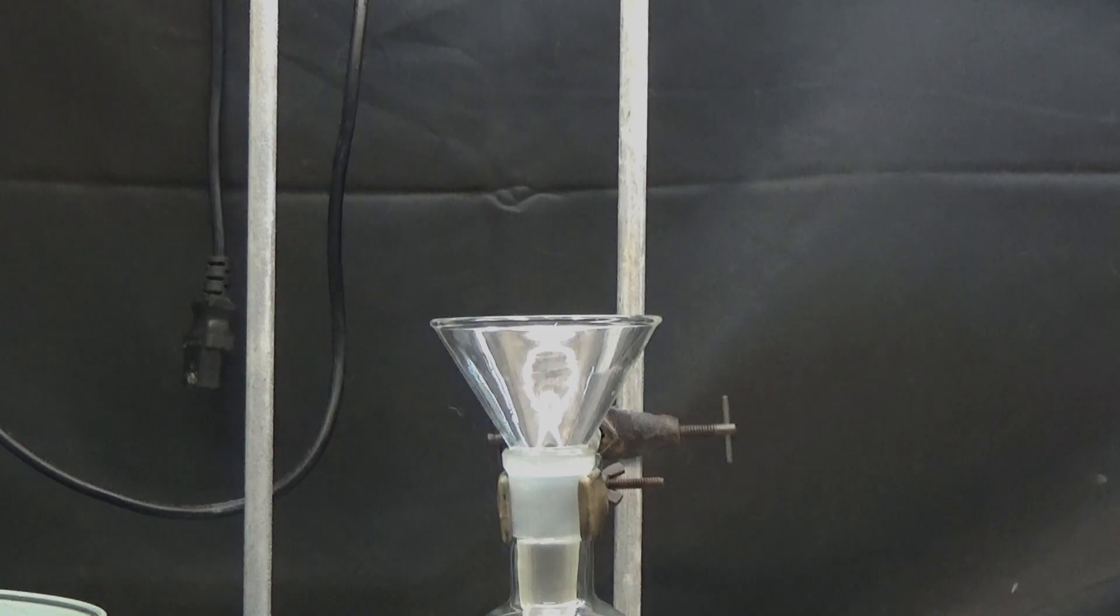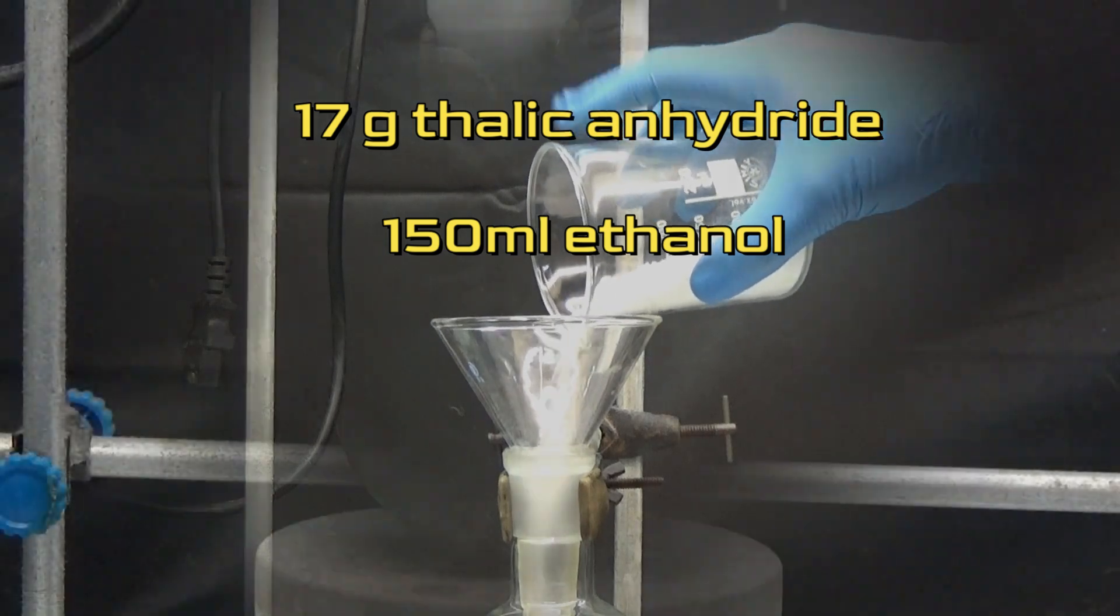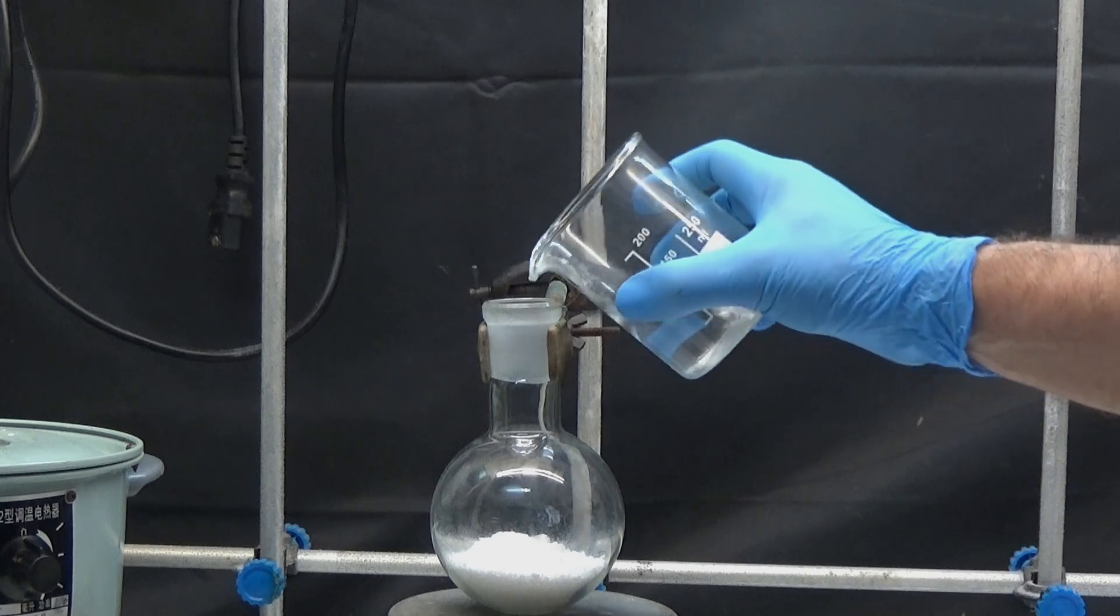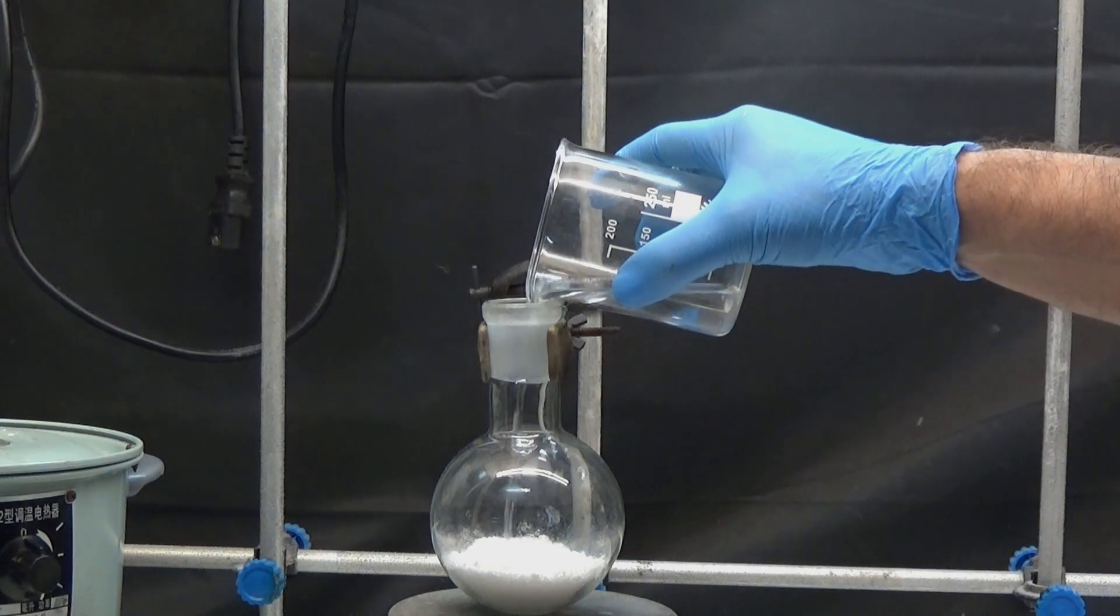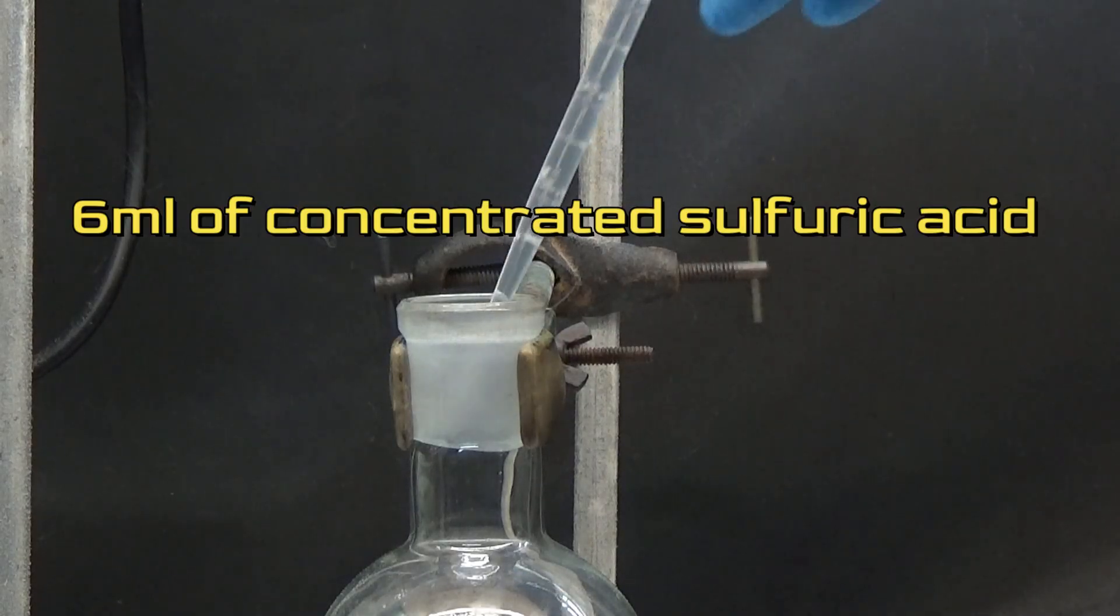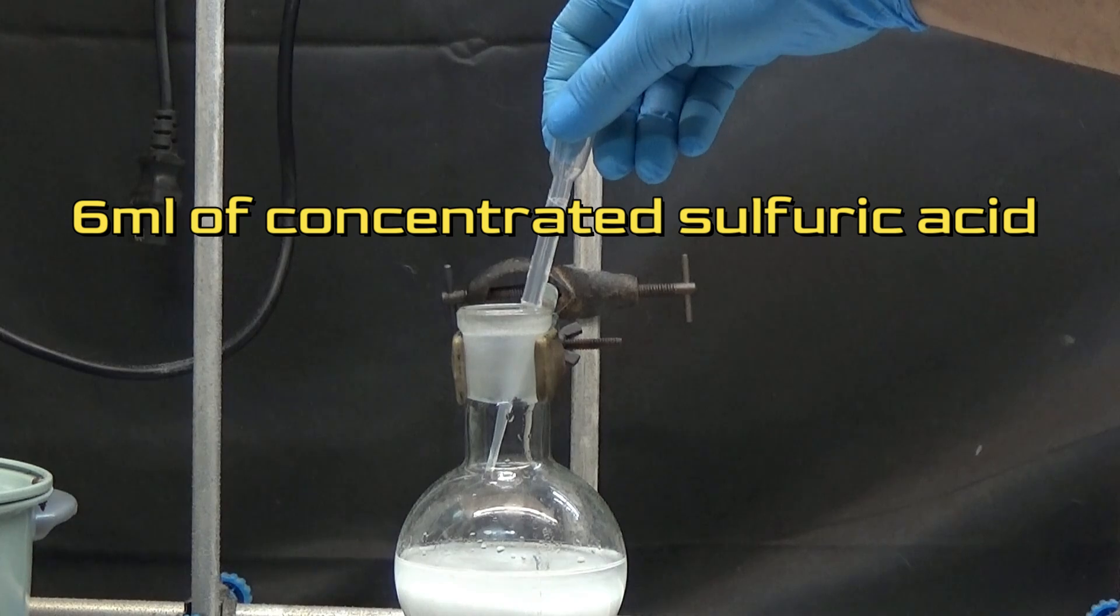In a 250ml flask, we put 17g of phthalic anhydride and dilute it with 150ml of ethanol. After all the substances have been dissolved, 6ml of concentrated sulfuric acid is slowly added.